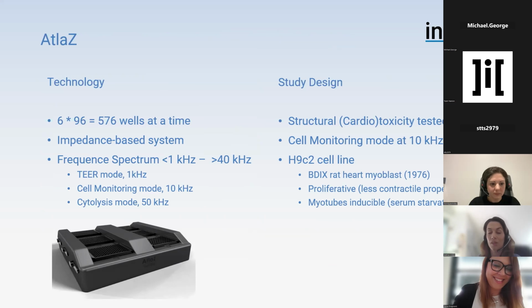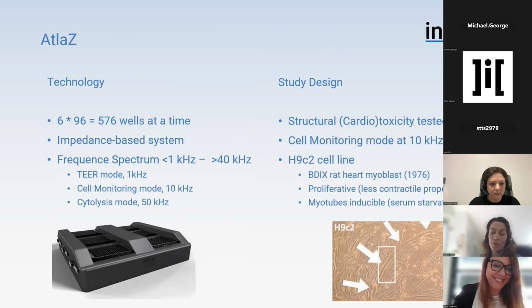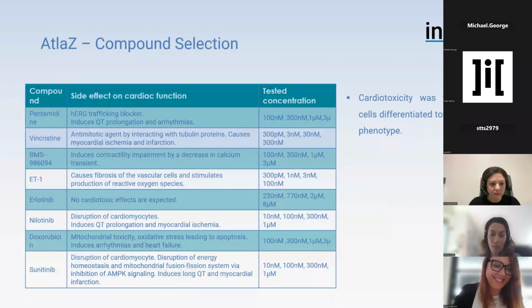So we had to use serum starvation again to induce the myotubes. But we were successful with doing that, so that was actually no problem. Here's the myotube, for example, and this cutout shows that we even have multiple nuclei, and therefore we were basically ready to go, plated them on 96 well plates, and performed this study within a week only.